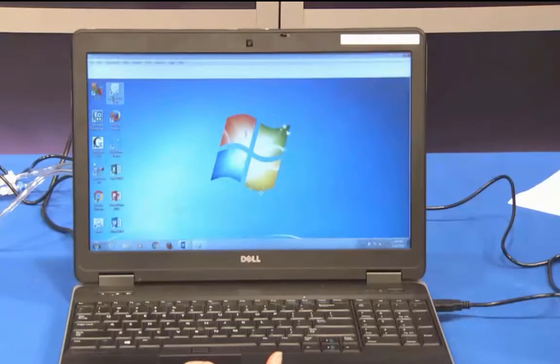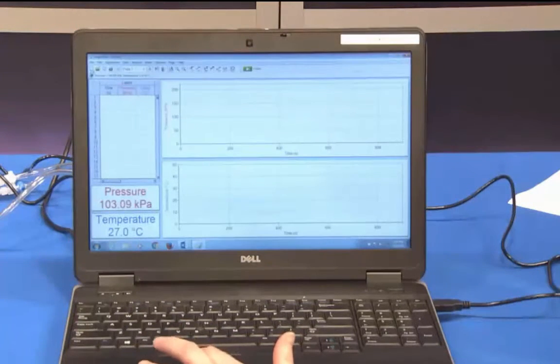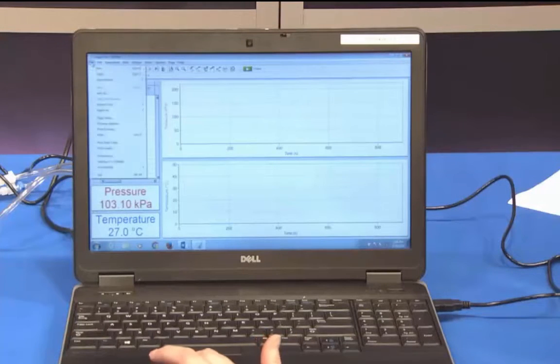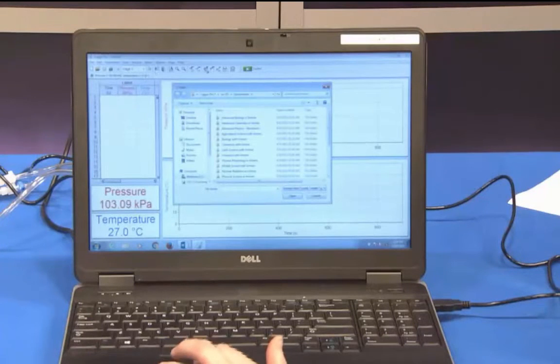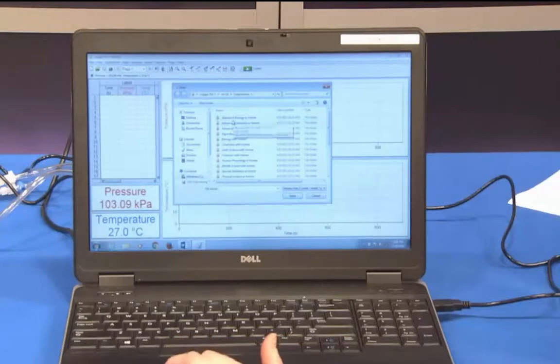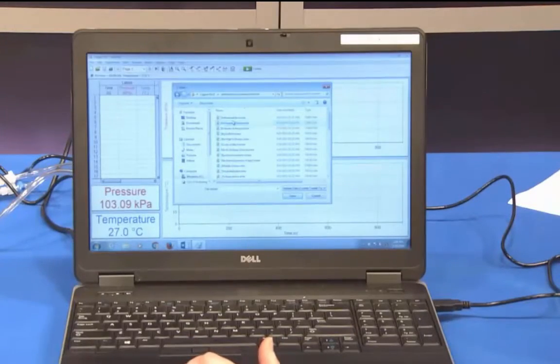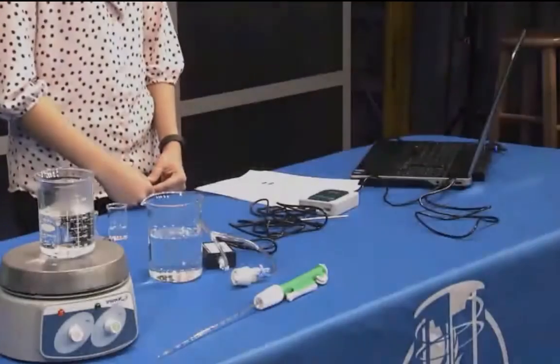Next, open the Logger Pro software on your computer. Finally, go to File, Open to open the Advanced Chemistry with Vernier folder. Open the file 34 Vapor. You should see a graph and a temperature and pressure box with the current temperature and pressure displayed.